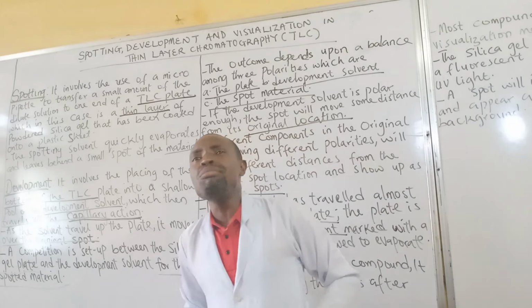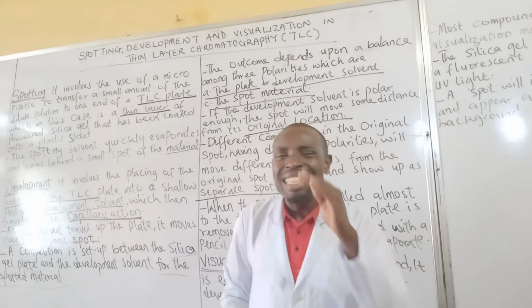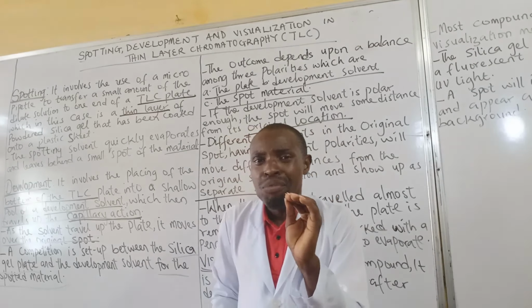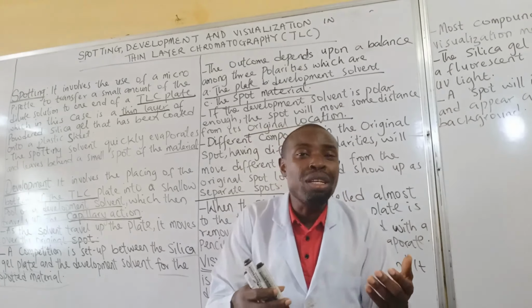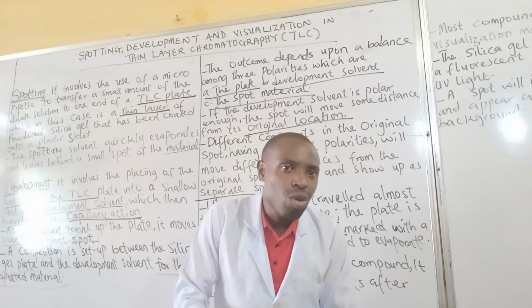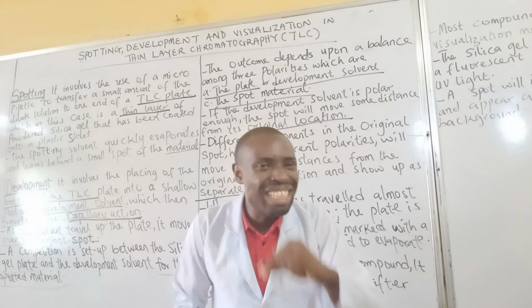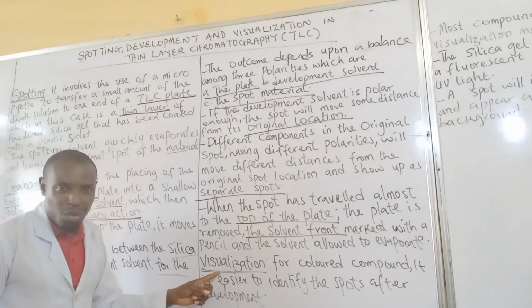But we should understand that most compounds, like organic compounds, are difficult to see. And as such, there is now a need for what we call visualization.